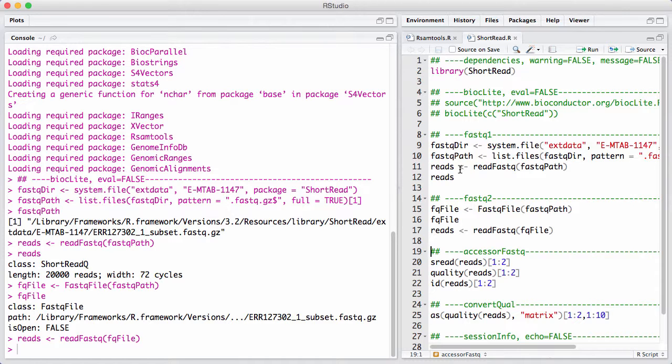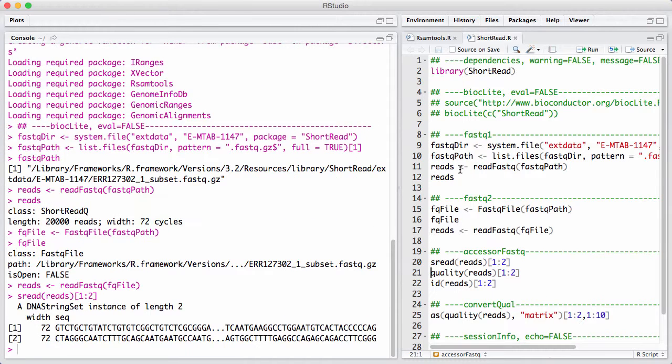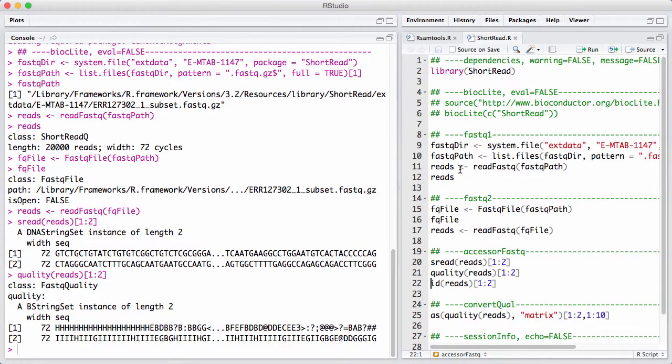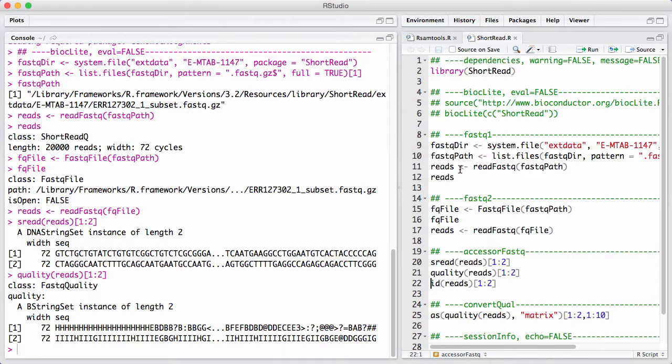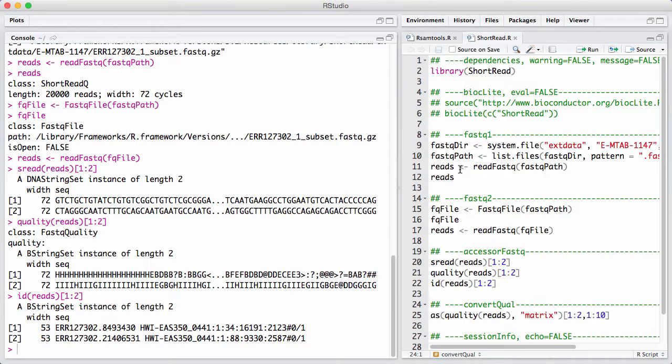So how do we access the information inside a fastq file? Well, a fastq file is conceptually pretty simple. It contains reads, base qualities, and read names. And we have accessor functions. sread gives us reads in form of a DNA string set. Quality returns quality values in some weird letters things that we are going to discuss in a little bit. And then finally, id gives us the read names.